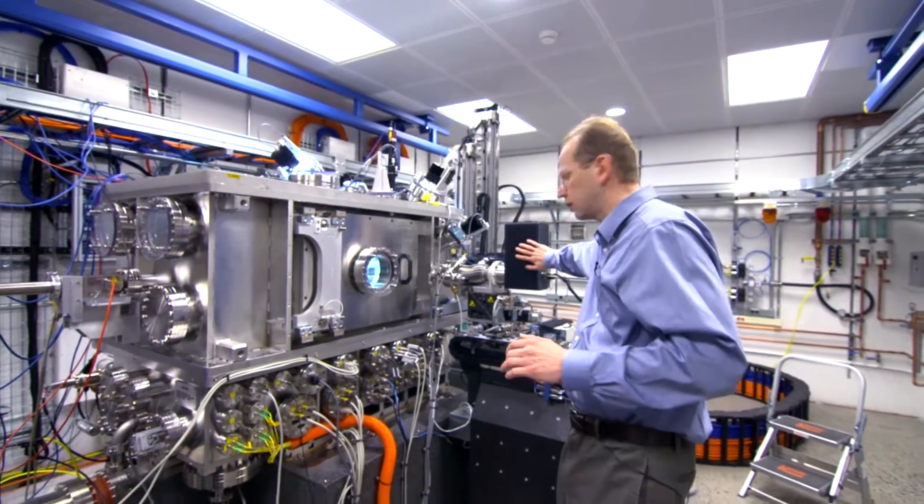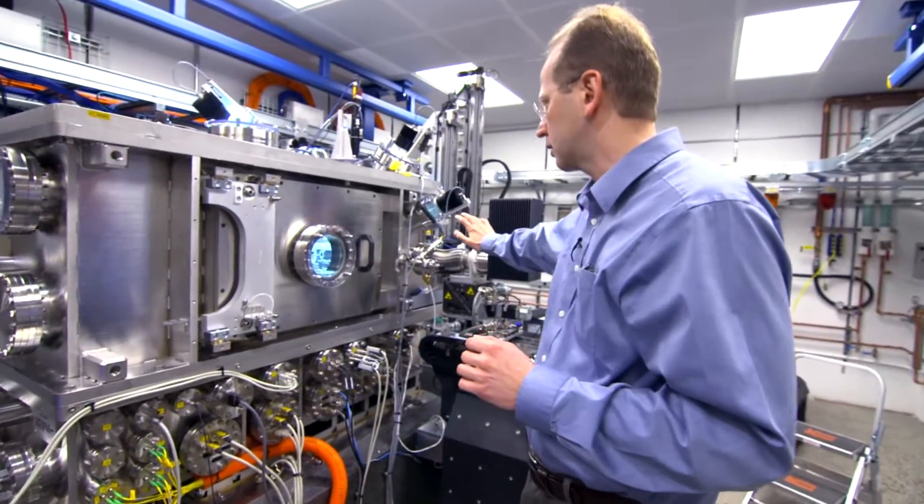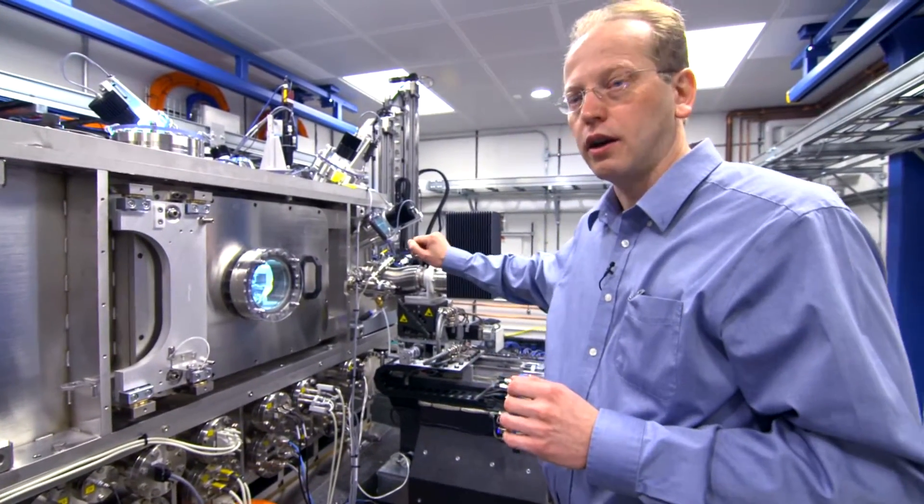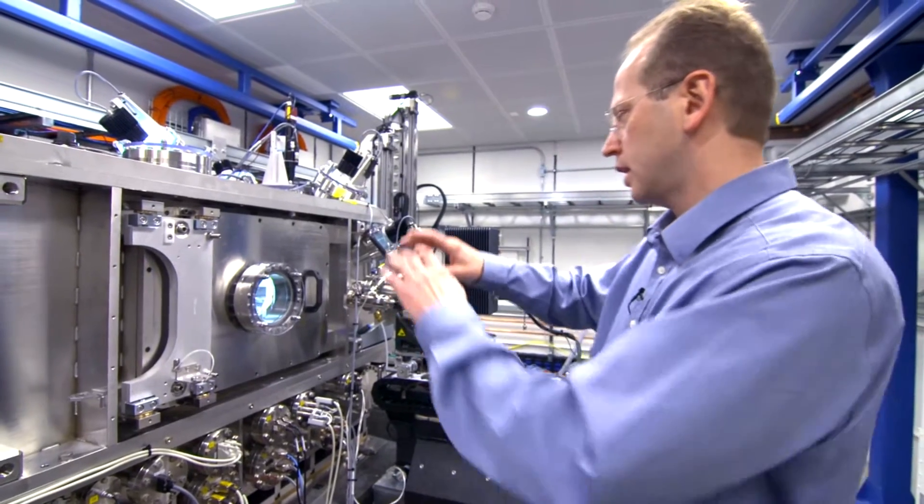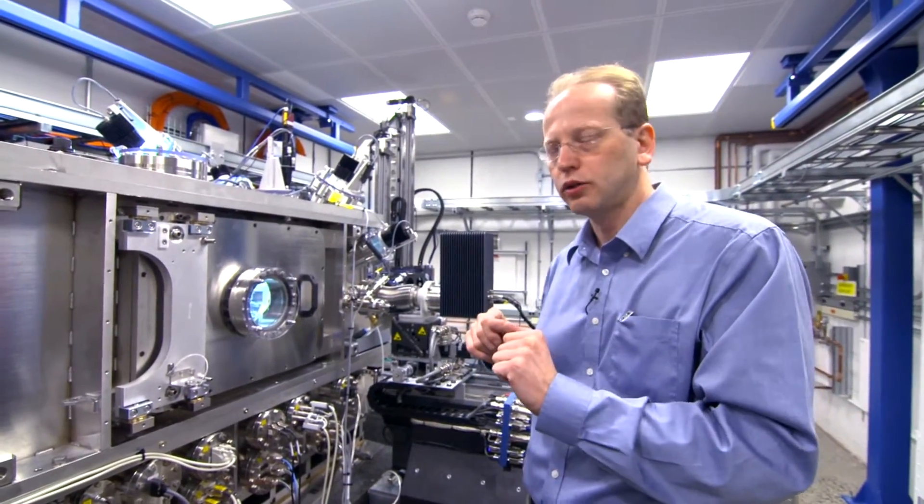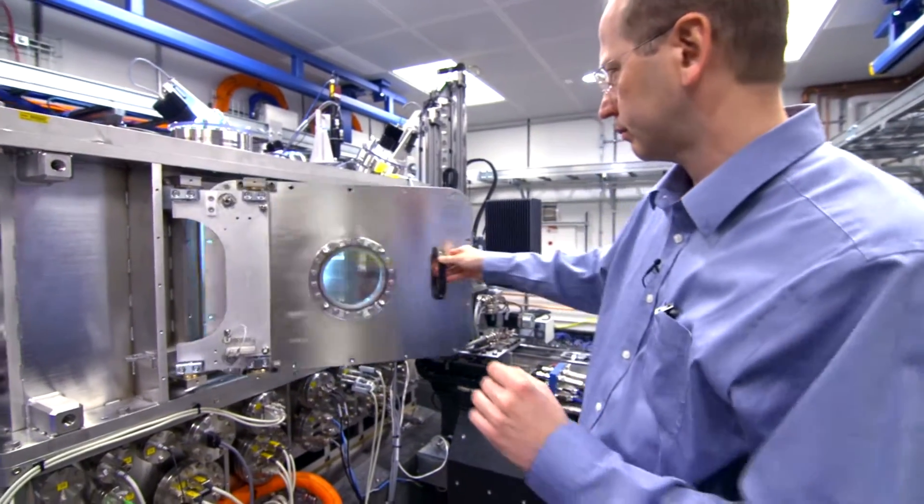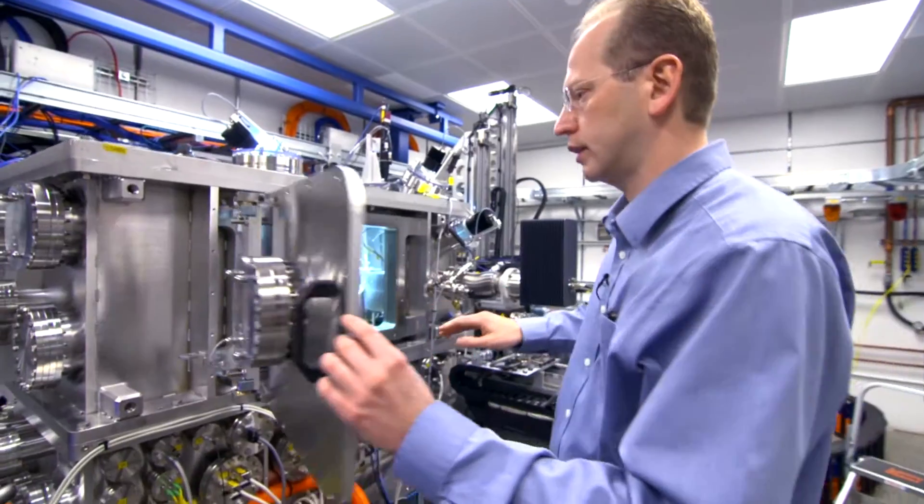This is one of the detectors, fluorescence detectors, which helps us to collect fluorescence signal from the sample which we study. And we have multiple doors to access the microscope, and this is one of the doors. So you can see we can open it and get inside.